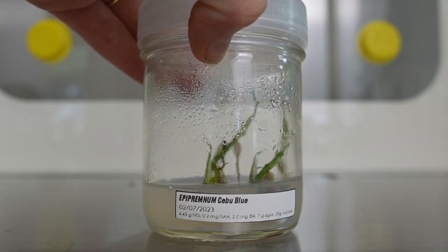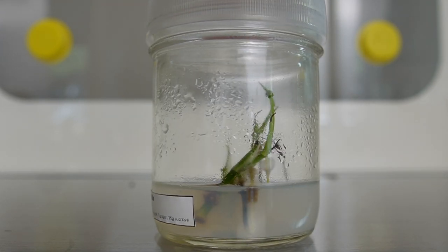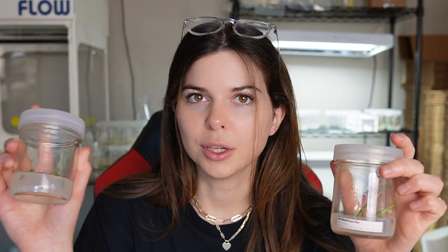I actually did a similar experiment with the Sibu Blues. This one I put into tissue culture February 7th, about six weeks ago, and it has done nothing but grow a ton of roots. The difference between this media that didn't work out and this media that's working really well is just that the working media contains TDZ, and the other one just contains BA. One thing I'm really interested in learning more about is why certain cytokinins work for certain plants.